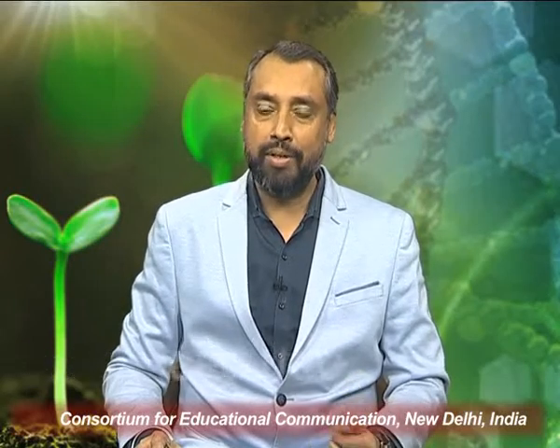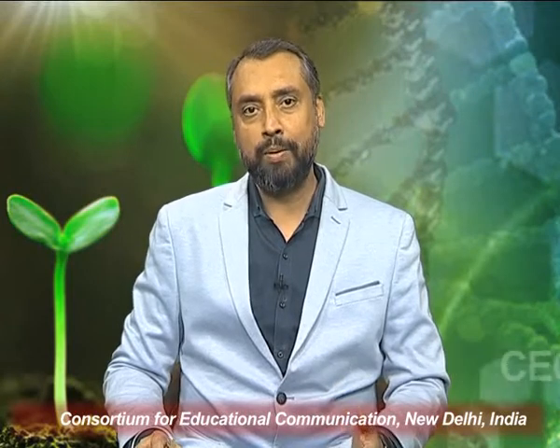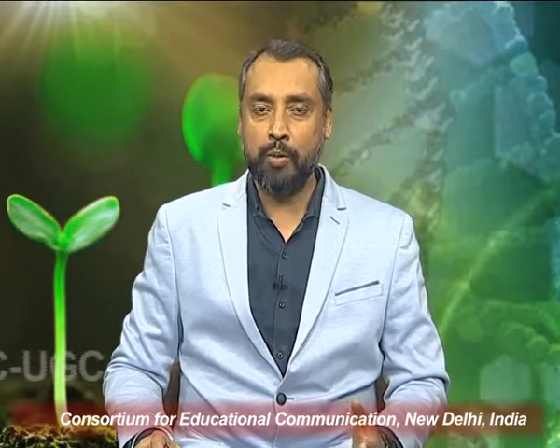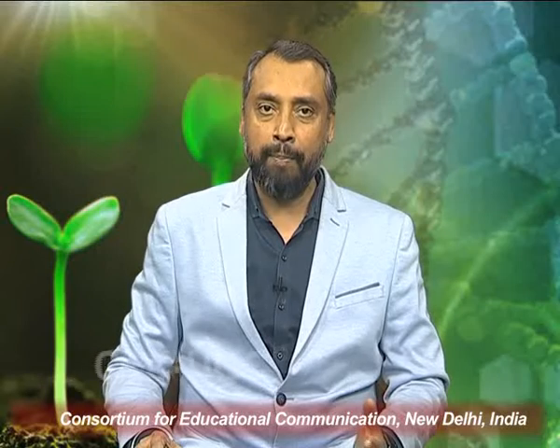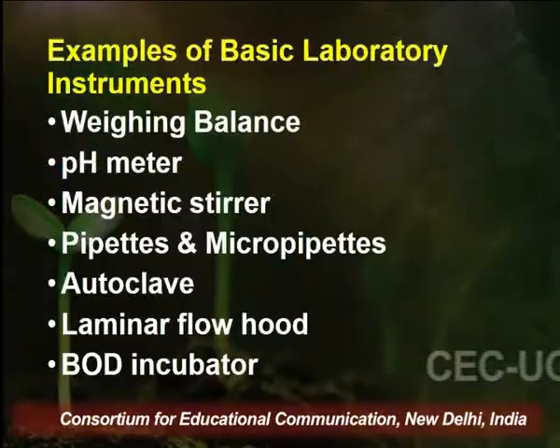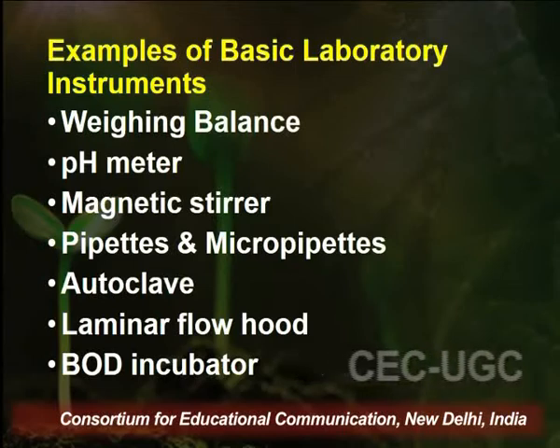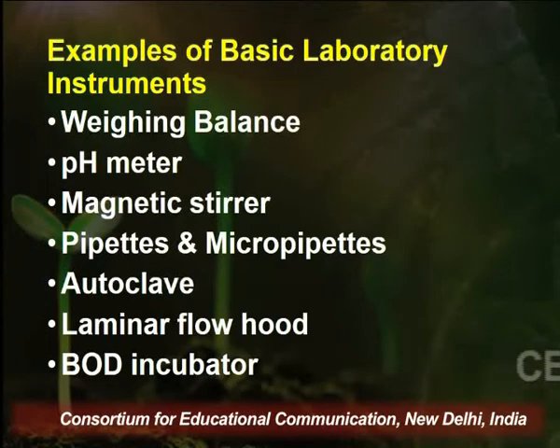So what are these fundamental laboratory instruments? Basic laboratory instruments include the common instruments which we use in our day-to-day laboratory experiments, such as the weighing balance. To work on any kind of compound or chemical, we need to measure how much amount we want to take, so this is one of the most basic instruments which anyone would use.